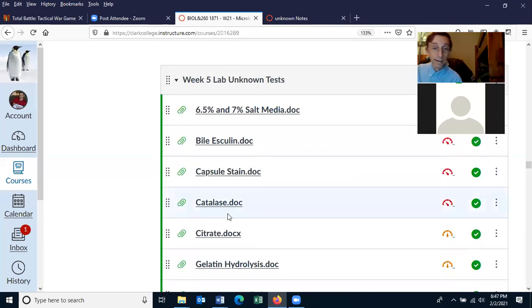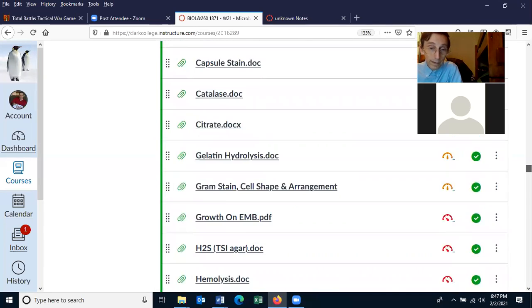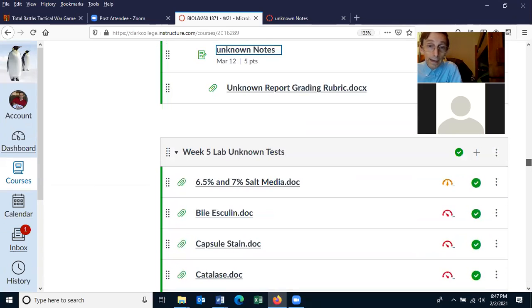The catalase test, assuming you have fresh bacteria cells, you can get the results in the same day that you ask for it. But most tests are not that quick. Most of them have to be incubated for 2 days. One of the tests has to be run for a week, the gelatin hydrolysis test. Okay? And I decided that that one splits the bacteria up pretty nicely.